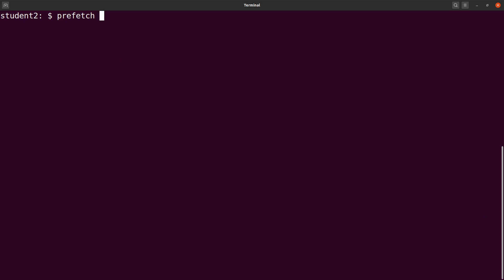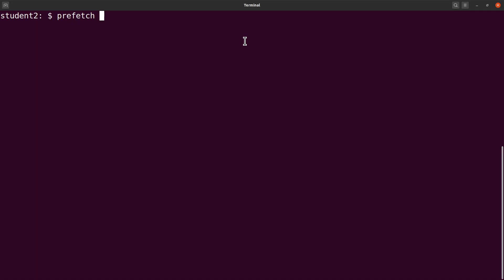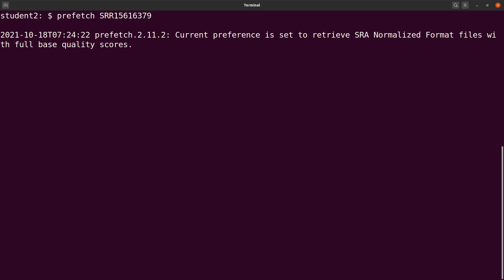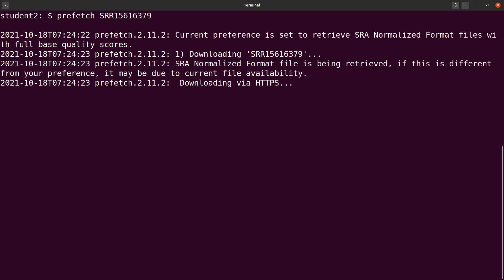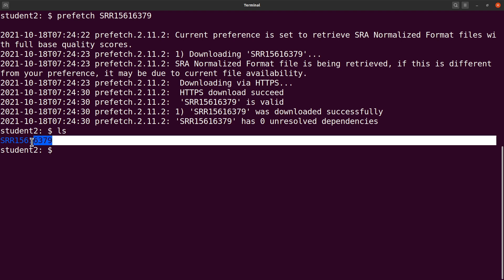So we say prefetch and then we specify the accession ID. This is my accession ID, and then I run it. Please know that the time taken to download depends on the file size, and prefetch also takes some space as well. We have it done, it's downloaded.